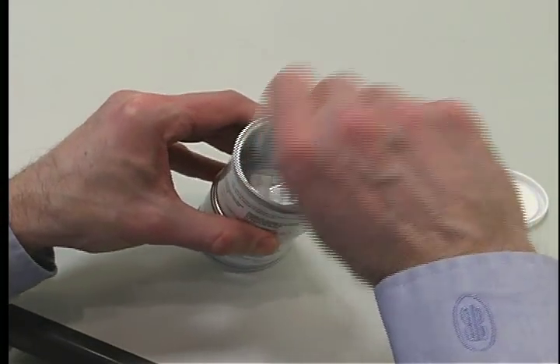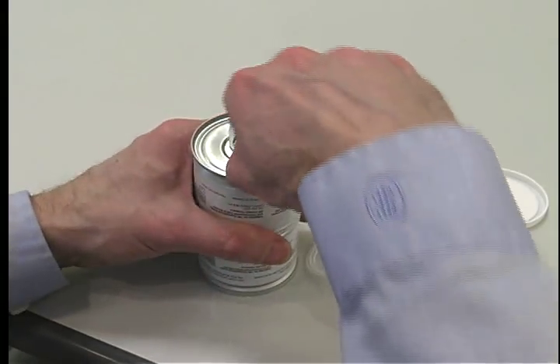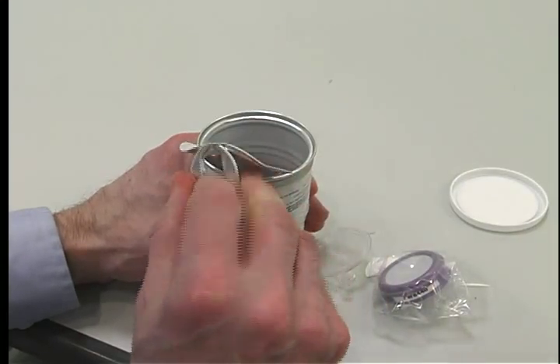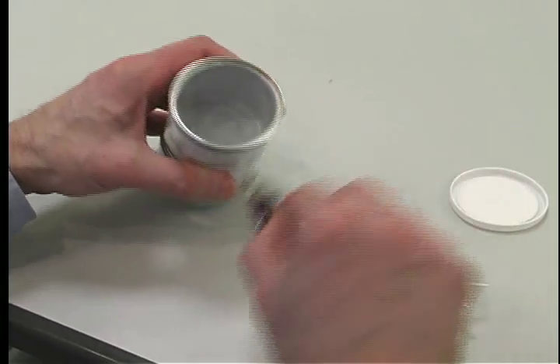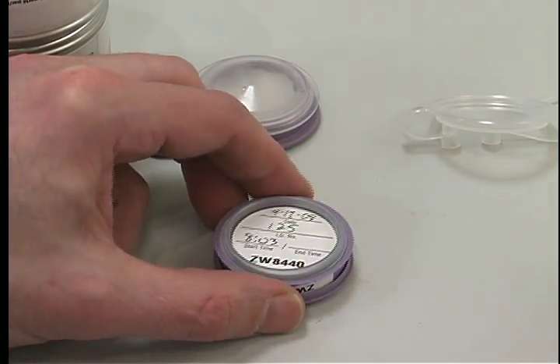Remove the monitor assemblies from the cans. Record the date, sample ID and starting time on the label on the bottom cup.